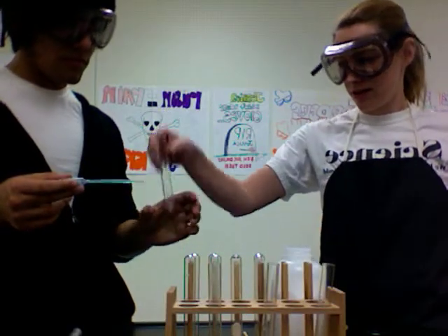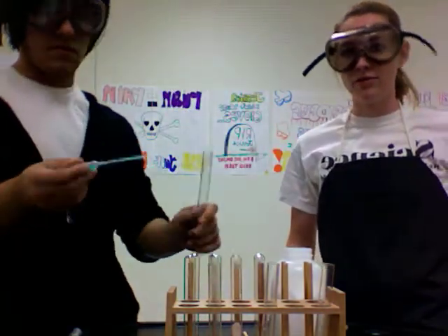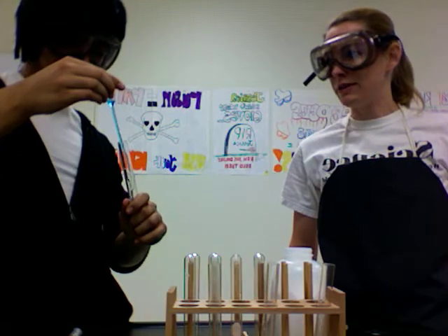Reaction number five takes some zinc, just regular old pure zinc, and copper chloride. Show that to the folks — it's blue, it's kind of pretty. And we're going to add the two of them together, zinc plus copper chloride, in a single replacement reaction.